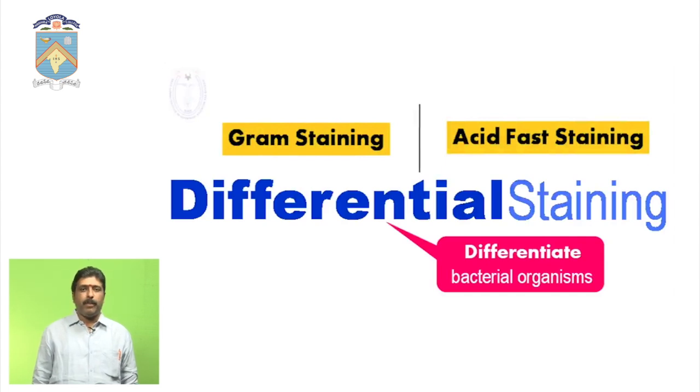Before discussing staining technique, every microbiology student must know about smear preparation. What is a smear? A smear is nothing but a culture. So, before starting the experiment, the culture should be processed 24 hours before.